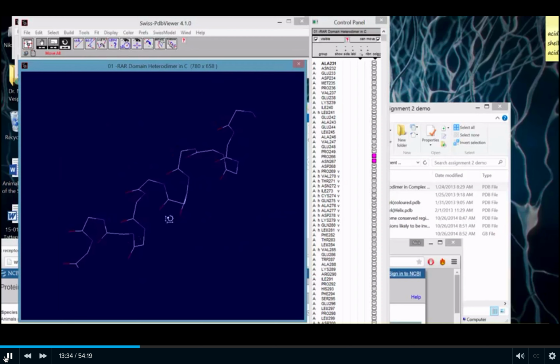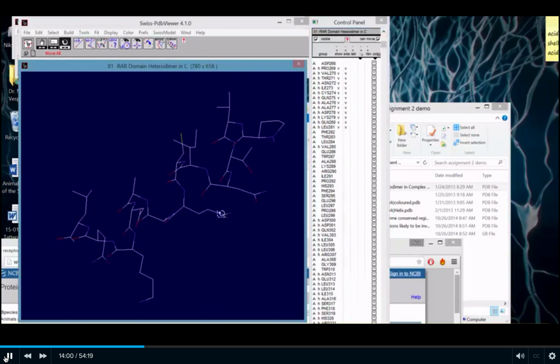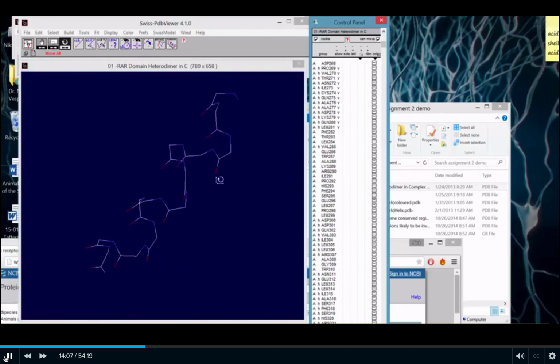So I'm showing just a helix here and just a backbone, because that's all I've indicated with this particular first column with regards to the ticks. The next column shows the actual R groups. So if I take a look, proline, proline's bent. You can actually see that right here. And valine, threonine, all the way down the line. Clearly I missed one there. But that's the actual helix now, with all the R groups jutting out from it. If I didn't want to show the R groups, I can simply remove them and have a backbone.